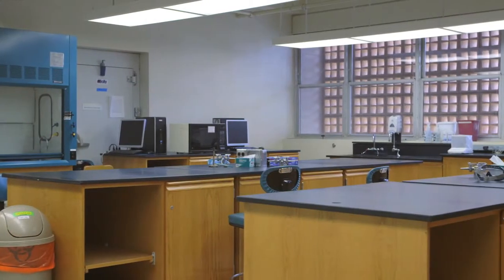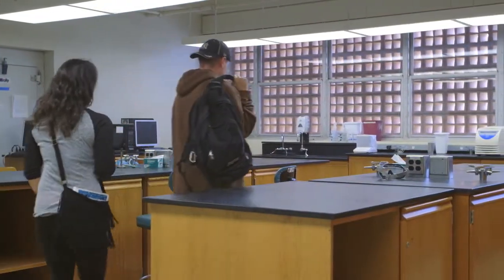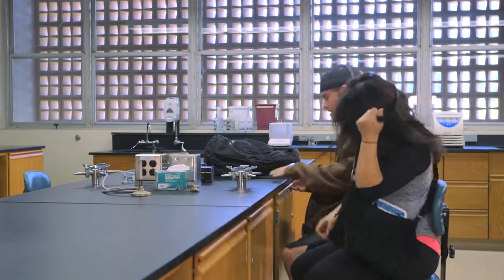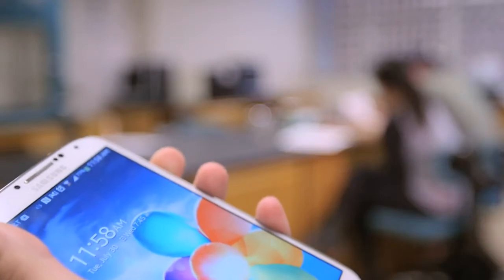Working in the biology laboratory can be an exciting experience. The lab can also be quite dangerous if proper protocols, safety rules, and most importantly, common sense are not followed at all times. It is important to start lab professionally by arriving on time.